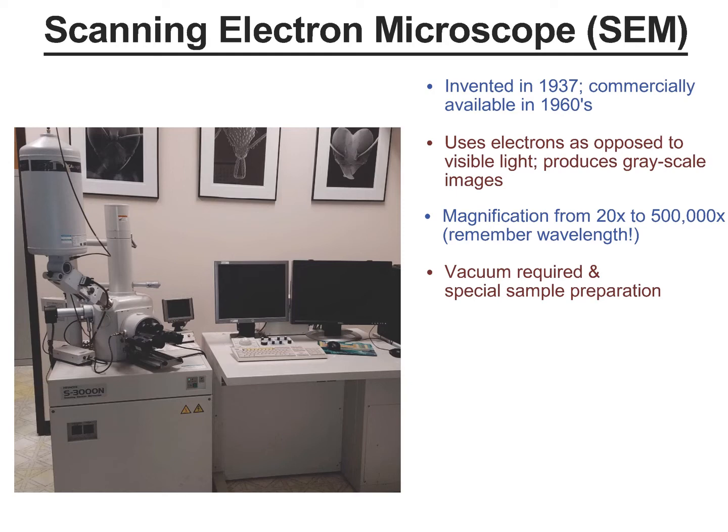And if biological specimens are going to be viewed in a vacuum, they first have to be dehydrated so that the interior of the microscope isn't contaminated with water or organic materials. We use special techniques to remove water from specimens without their shrinking or becoming deformed.